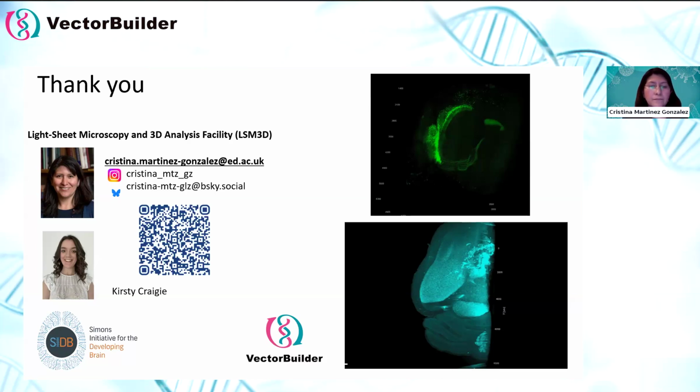Nice. And then I think this will be our final question, unless anyone wants to add any more to the Q&A box. So this is a question that's more related to quite specific downstream application. If tissues or cells are fixed with PFA, they were wondering if you have experience with that affecting downstream next generation sequence library construction, because they're thinking about maybe cross-linking might impact the DNA quality or amplification. I don't know. I mean, that I don't know.